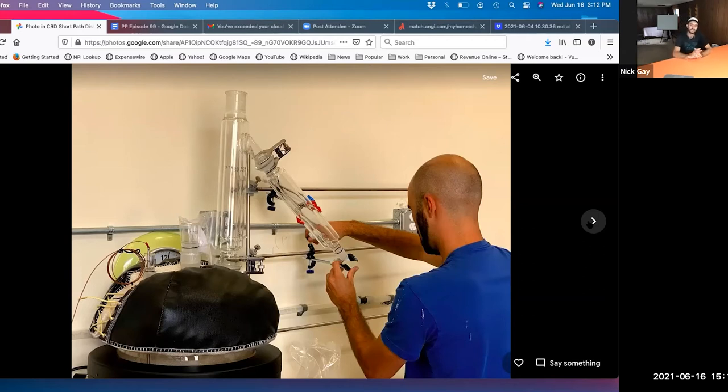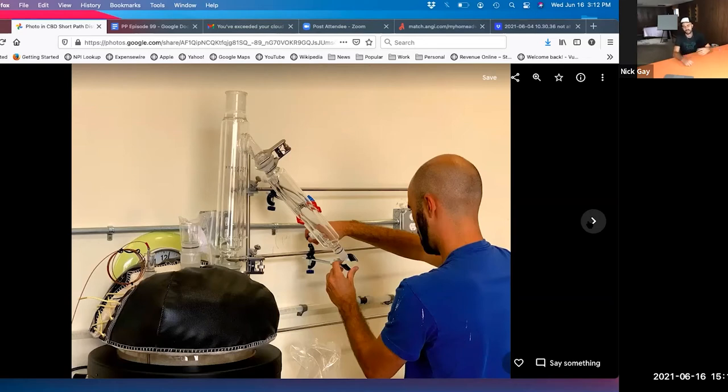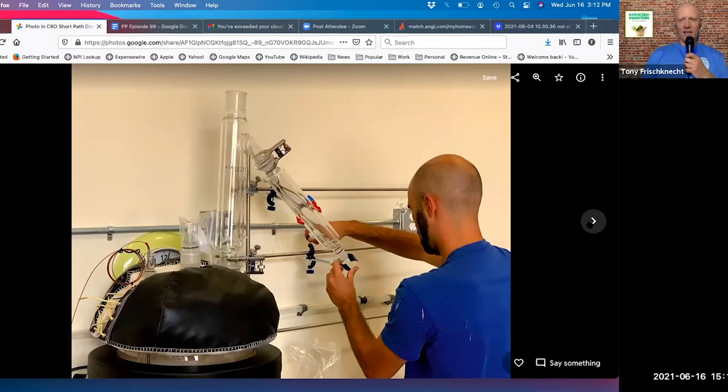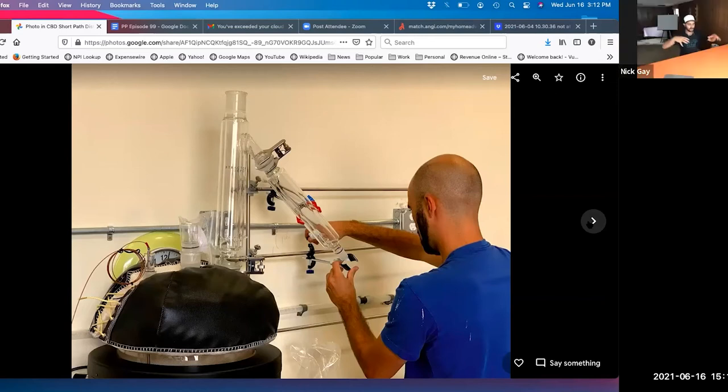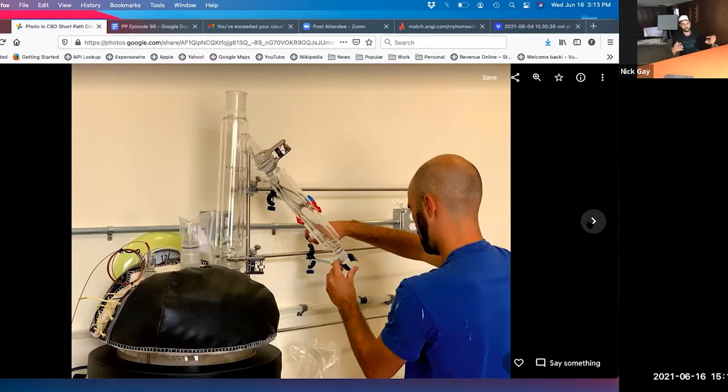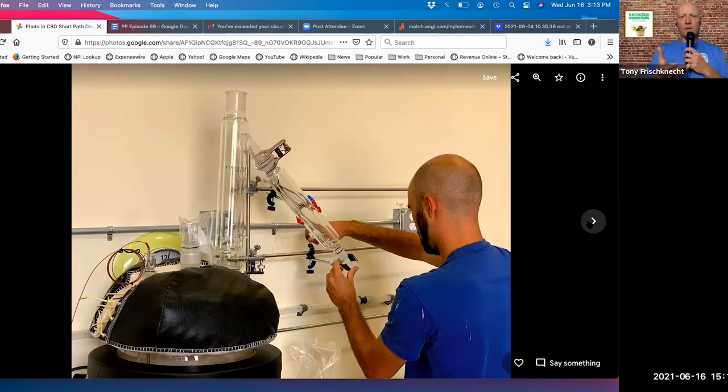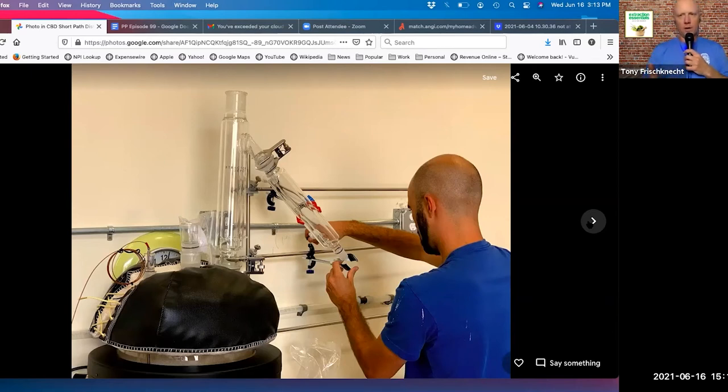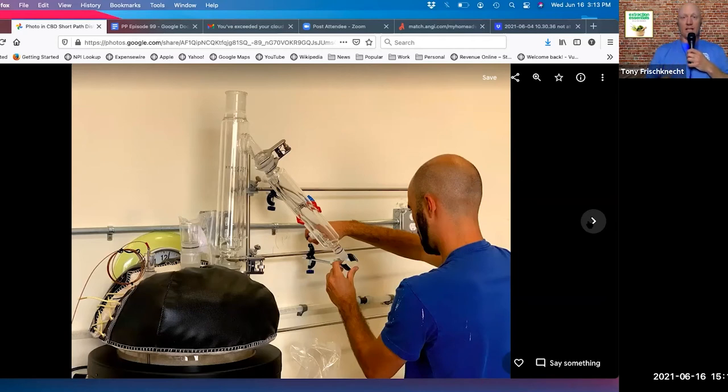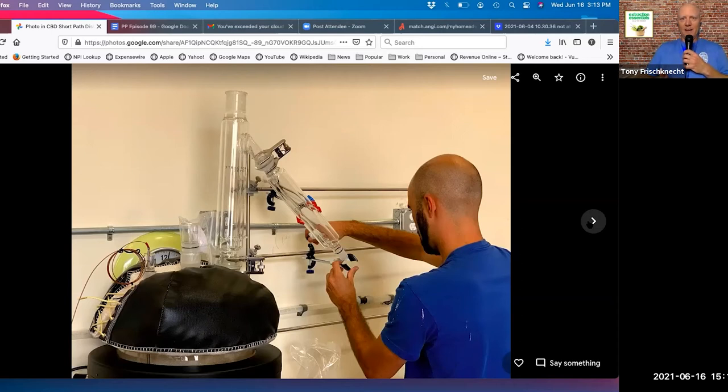It's a similar process but even more so. You're more likely to see a system like this in a high-end chemistry lab than at a distillery. We have the heater at a certain temperature, everything's stirring, it's under vacuum, and there's all these different components that add to the efficiency of the system. In something like this you're controlling the environment much more.